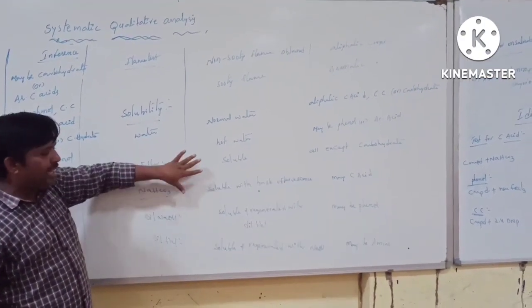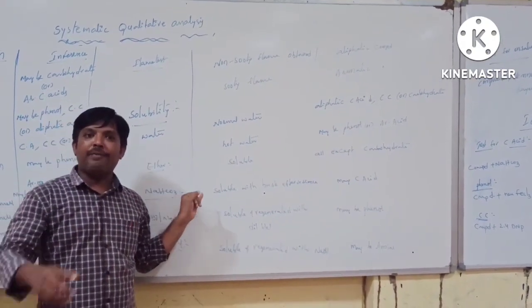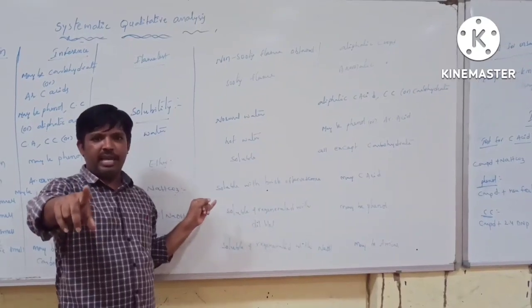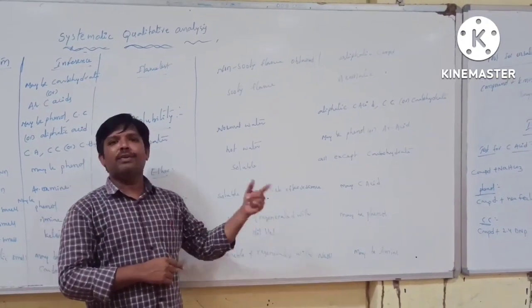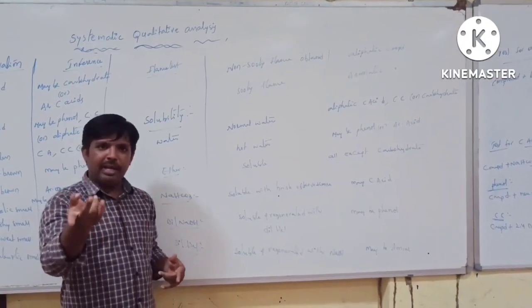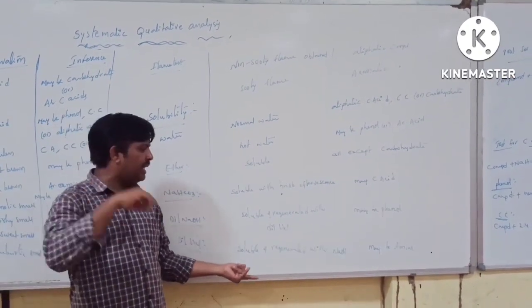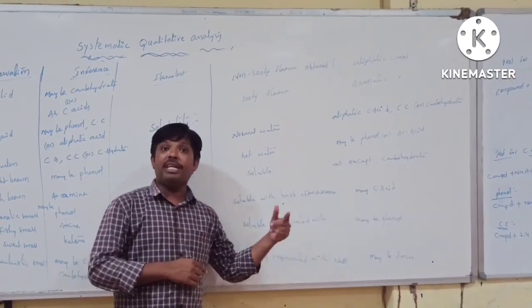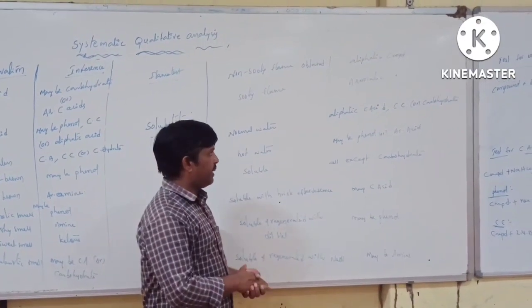If it is not soluble in ether, carbohydrate. If sodium bicarbonate gives effervescence, carboxylic acid. If it dissolves in NaOH and regenerates, phenol; if it does not regenerate, carboxylic acid. Dilute HCl soluble and regenerated with NaOH: amines, basic in nature.